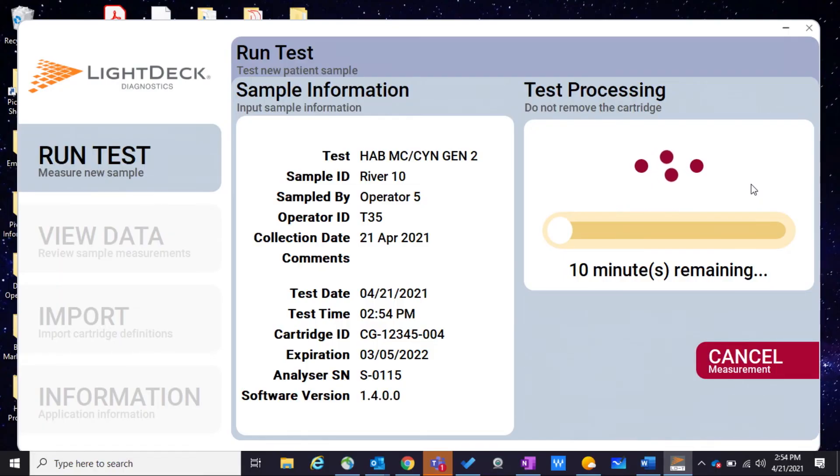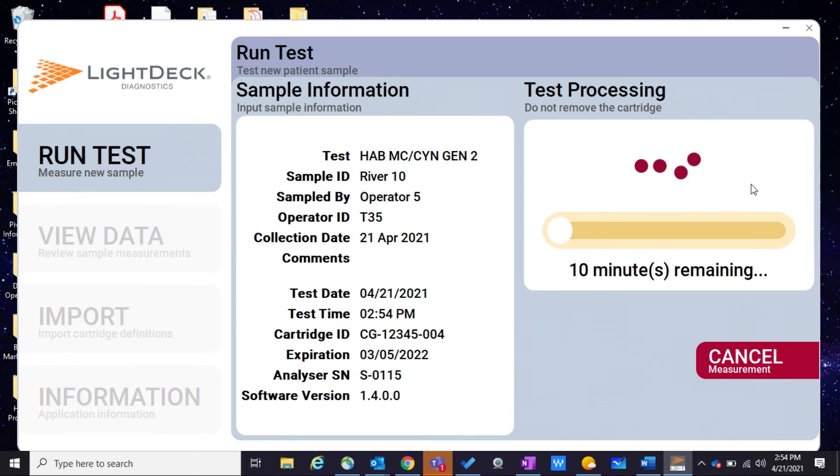Once the cartridge has been inserted, the LightDeck Mini will automatically begin sample analysis. The rest of the test is automatic.